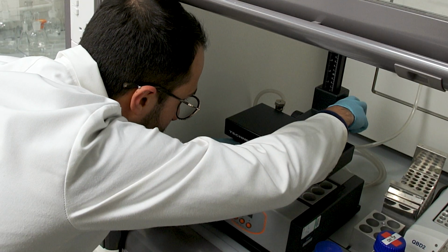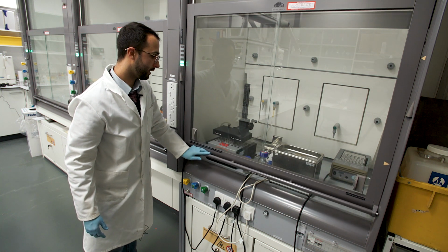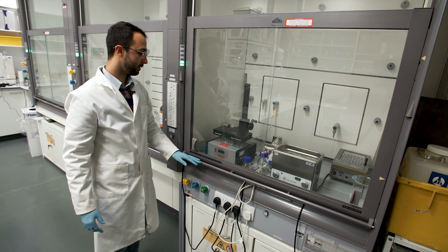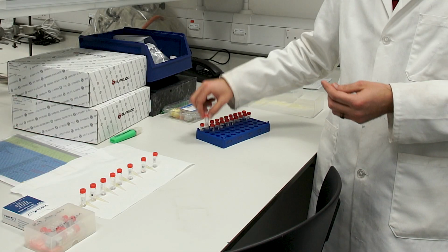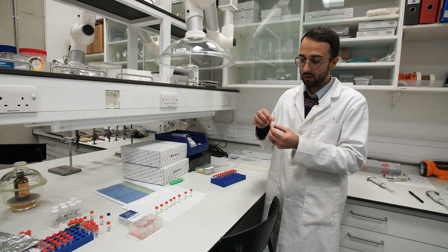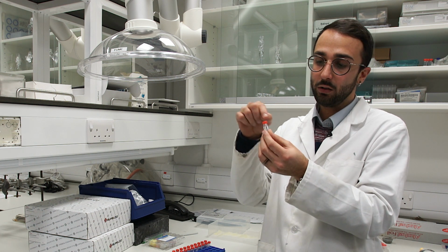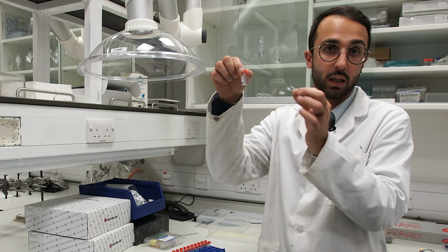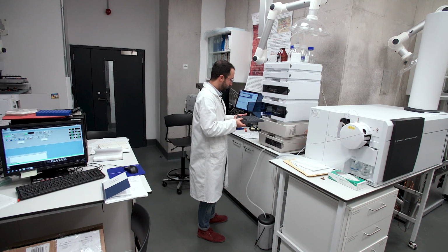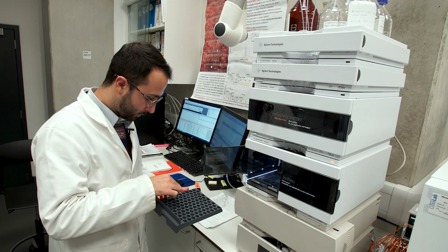So now I turn the nitrogen on, and this is gonna take, let's say, 1 hour before all the solvents evaporate. Okay, so now we are at the end of the extraction procedure, our samples are ready. Our dye molecules are dispersed in this solution, and the solution is okay to be analyzed using high pressure liquid chromatography mass spectrometry.